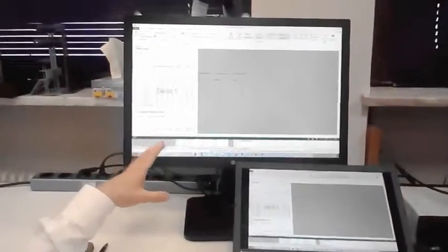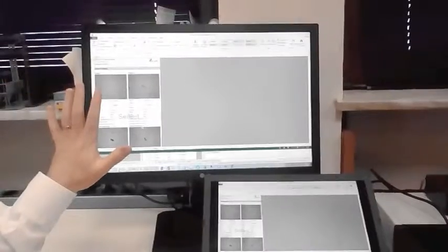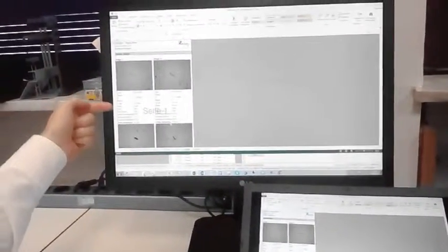So inside some of these specifications like ISO 16232 and VDA BD19, you'll know that there are much more detailed requirements, and I mentioned that the system is fully compliant with those. So this particular report gives us also a lot more detail about those too. And then finally, the images that Karen tagged are also contained here. So whichever particles are marked, where we mark them just after we've analysed, they will also be included in the report, again with each of their individual attributes as well. So the height, the ID, the length, the width, the type, and all this kind of information.